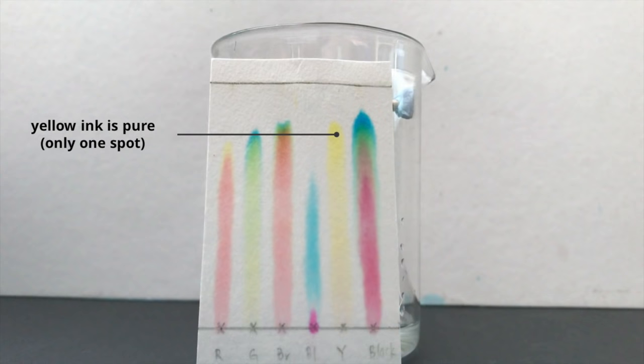Let us take a look at the results. We find that many of the inks are made up of a mixture of dyes except for the yellow one because there is only one spot. We can say that the yellow ink is pure because it is only made up of one dye.